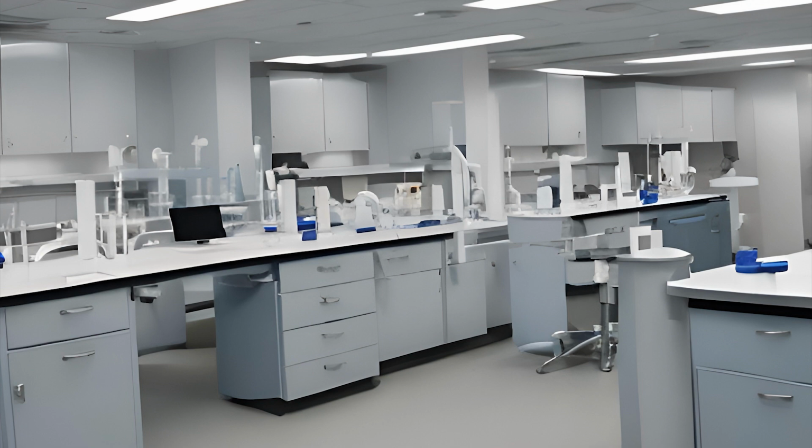Identifying properly that you have the right patient and the right sample to do the work with is the most critical step in the entire laboratory process. Everything else can be done flawlessly, and it doesn't matter. Because if the pre-analytical phase isn't perfect, everything was a potentially dangerous waste of time.